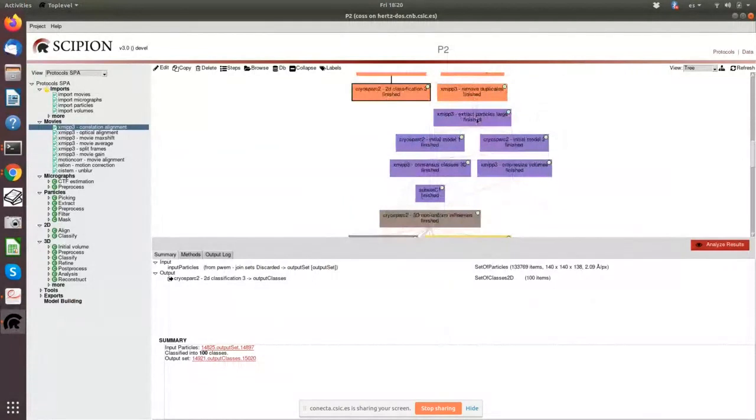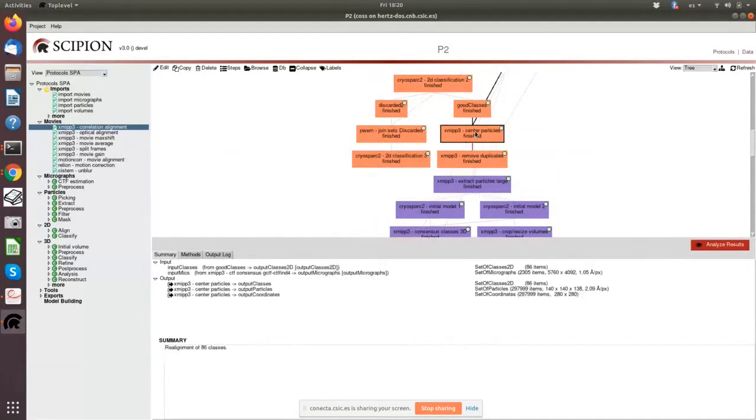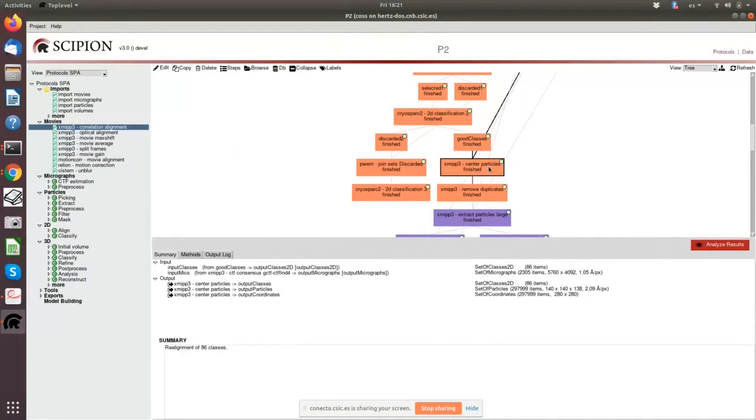So now I extracted, here there are a couple of steps that are kind of administrative steps, but I find them very useful. Some of the coordinates have been found twice on the same particle, but because they are farther apart than your threshold, you cannot distinguish them. But when you have performed the 2D class alignment, you align your particles to the class, and those classes are normally centered. So now you can better realize whether your particles are really the same or not.